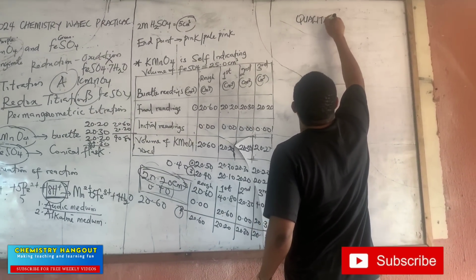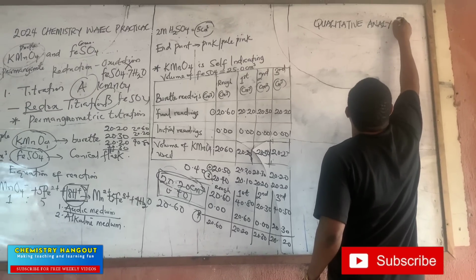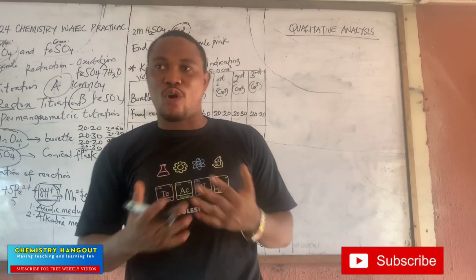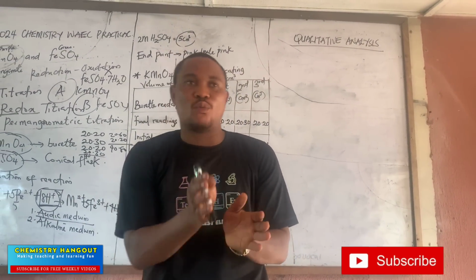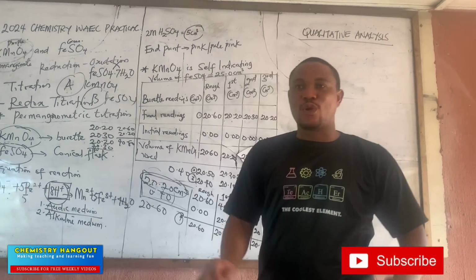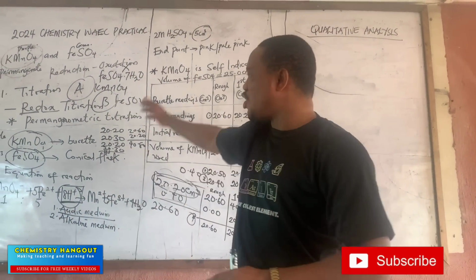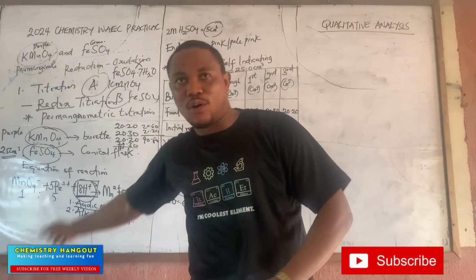Please, I want us to pay attention to this. Don't forget, I said I'm still coming with my prediction of how it is going to look like. It's my prediction, but I need to do this to guide my co-educators and the students on what to do, what to expect, how to go about it. I want to believe the titration is clear. Don't forget, I'm still coming with my prediction for the titration, the question, and how to solve it. This is just showing us how to prepare the reagents, what are the things we need to do, what are the things to expect, all sorted.